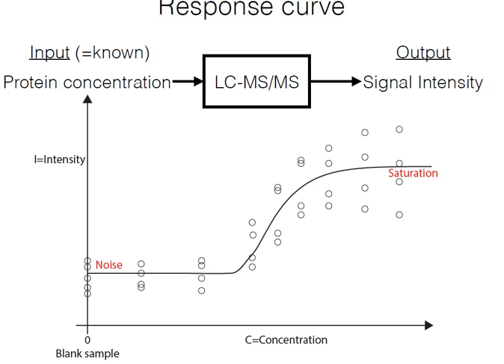So the first thing you have to do is build a calibration curve. Basically, you measure the intensity of spikes with known concentration, and you get this curve here. This is the canonical response curve that you would observe if you had low enough concentration spikes and very high concentration spikes. Very often, you only observe the linear part, this region here. But if you actually do get measurements in the saturation regime, which doesn't happen very often, it does complicate things for the LOD.